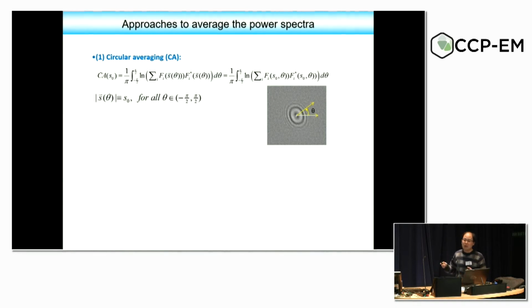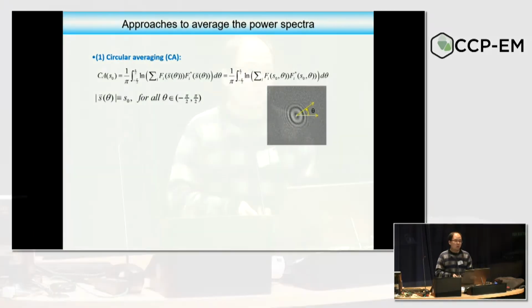In addition to the statistical verification of your CTF estimation, I would suggest that we use some direct visual validation, because we can see clearly how our micrograph looks. Instead of just looking at the value statistics, I would check each micrograph.